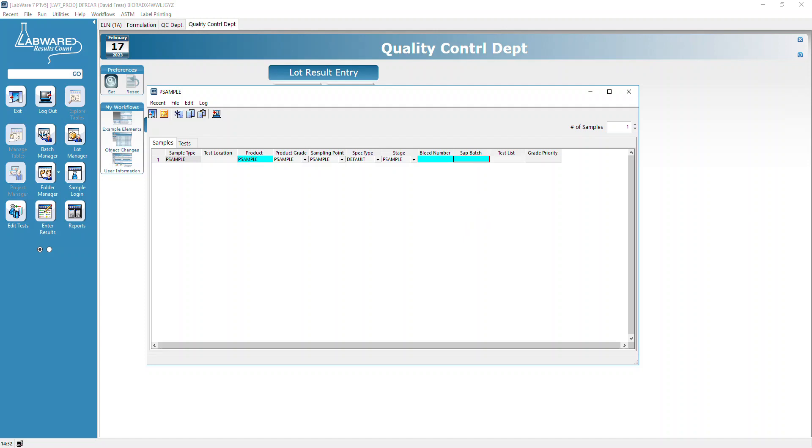We're going to leave the bleed number alone for now and put in the SAP batch, which I believe is going to be the SAP inspection record.